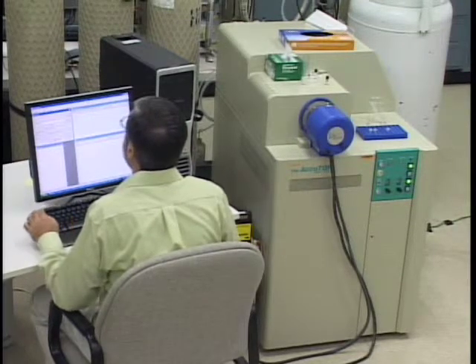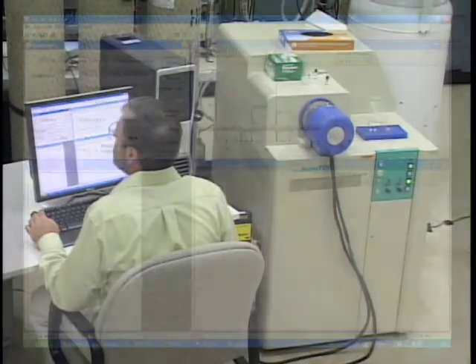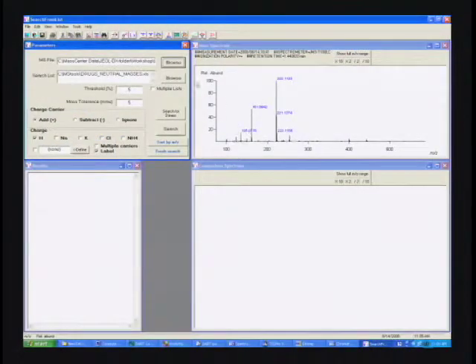All right, we finally have the correct spectrum up here. So now we've pulled this up. This is the 60 volt spectrum that we saved in the spectrum viewer. And what we'll want to do here is not search the drug's neutral masses, because at this point there's a possibility that we could have lost our molecular ion.